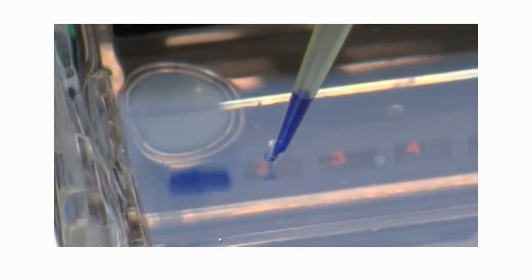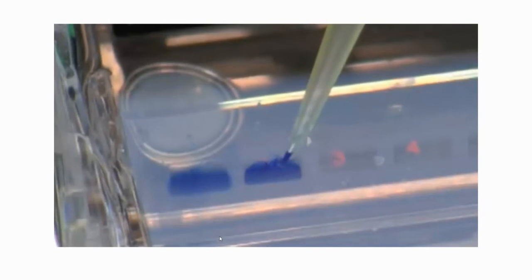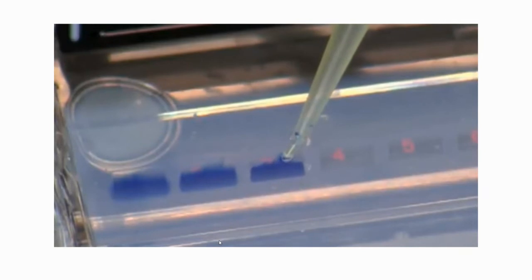When loading the samples, keep the pipette tip perpendicular to the row of wells. This will reduce the risk of accidentally puncturing the wells with the tip. Lower the tip of the pipette until it breaks the surface of the buffer and is located just above or just inside the well. Slowly apply pressure to the plunger button and observe as the sample fills the well. Make certain you stop at the first stop on the pipette, pause, then slowly remove the pipette while keeping your thumb down on the plunger.